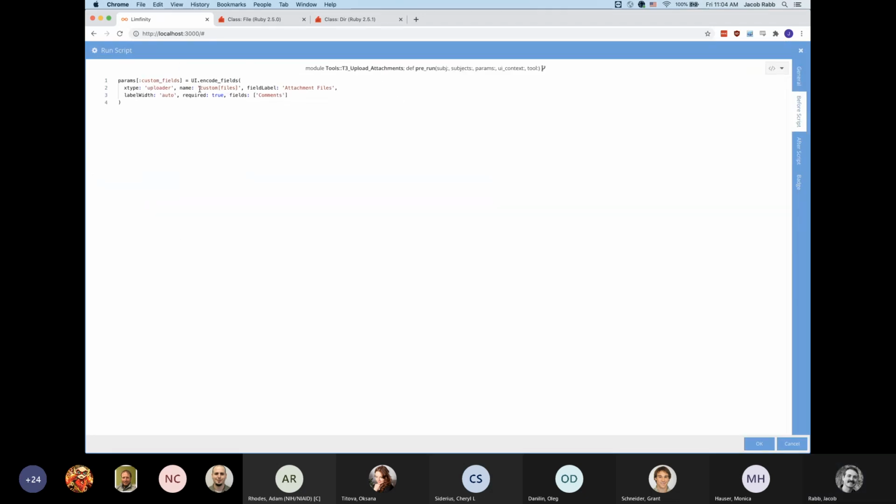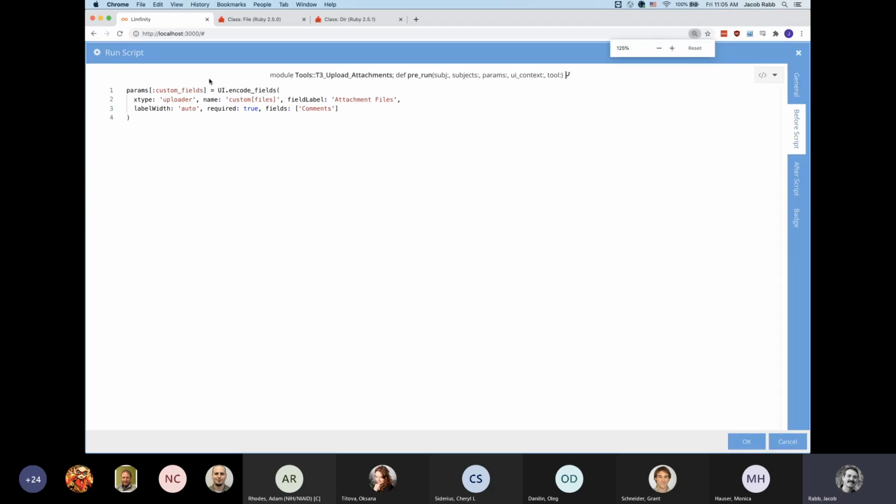First of all, the before script actually shows that nice little form where you can upload the files. The way this is done is by using a custom X type called uploader. It is not used for any real UDFs because, like I said, there's not any UDFs that have multiple files as values. But as long as you're able to process them in the after script, you can use it in the before script. This example is pretty canned. You can basically just take this and go. I'm going to zoom in a little bit too when we're talking about these.